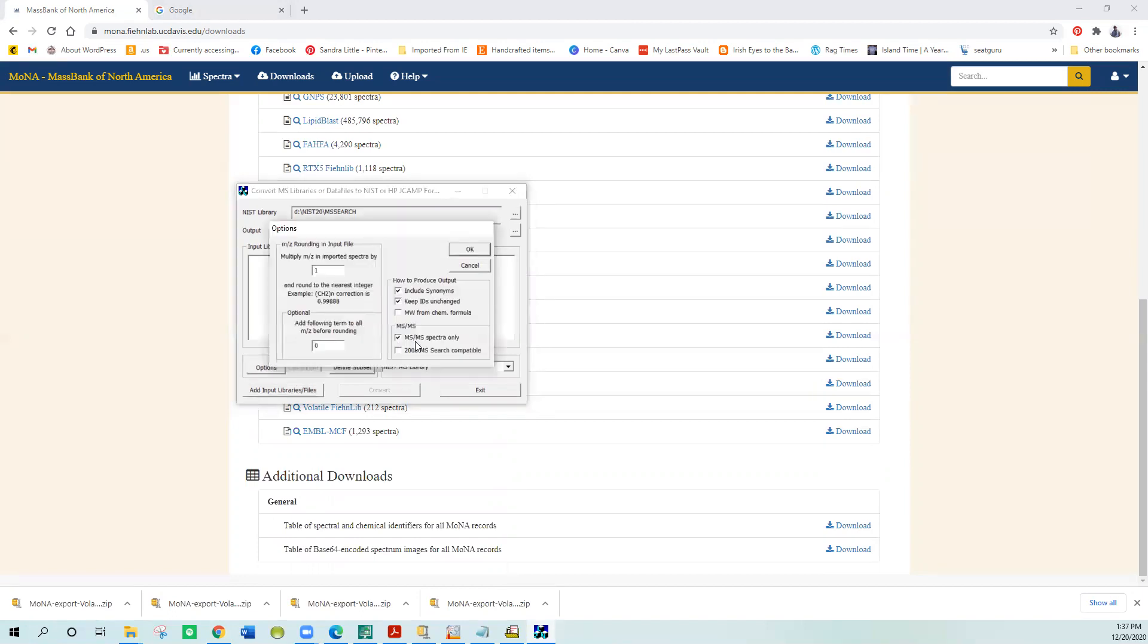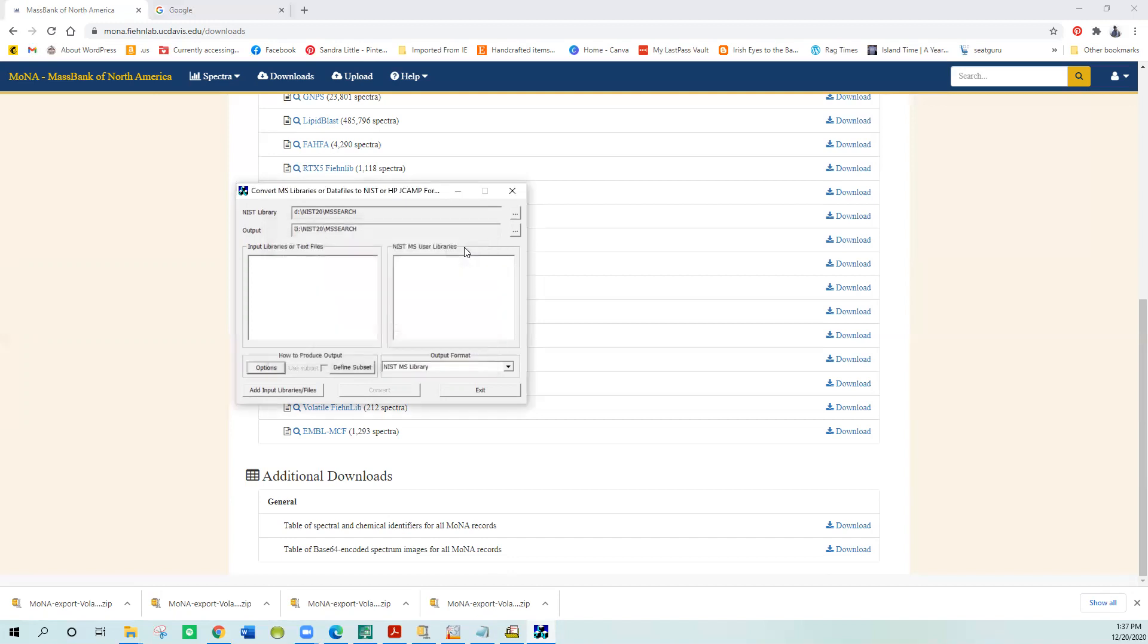The most important one is this MSMS Spectra only. If you try to bring in one of the larger databases like the MONA database, 142,000, it only does around 50 something thousand. There's some upper number if you don't select this. You need to make sure you do that to get it in the right format. It'll allow you to convert larger databases.